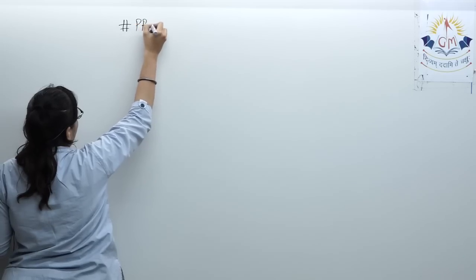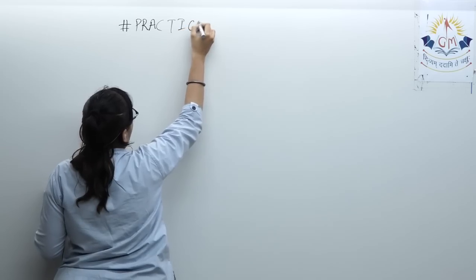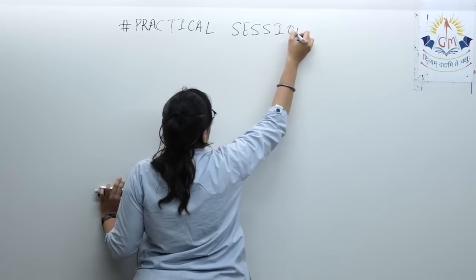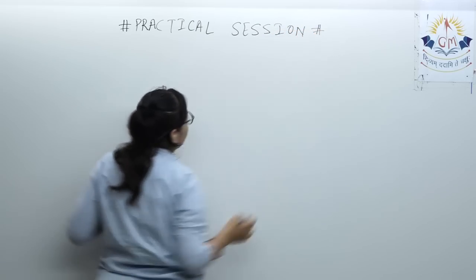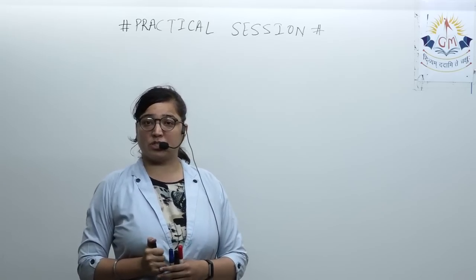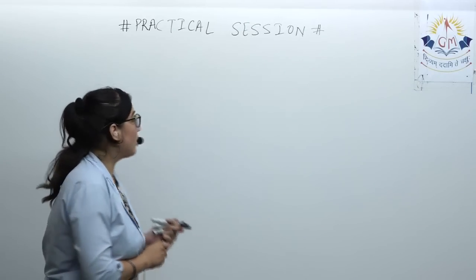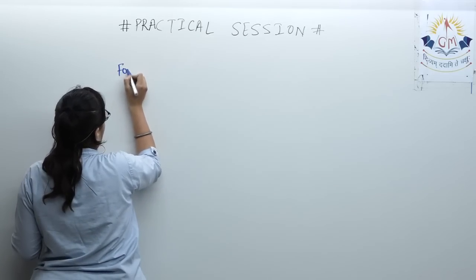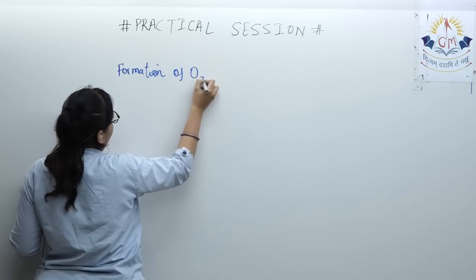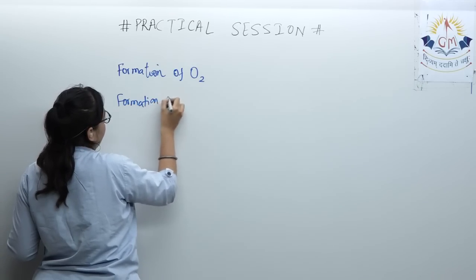This is a special practical session. In our today's special session, we are going to see the formation of two gases, that is oxygen gas and nitrogen dioxide.